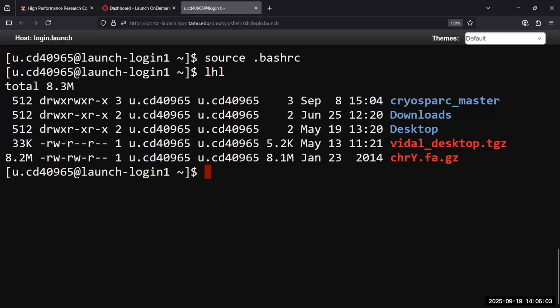Let's see your, you need to take space out right there. Oh, look, wait. Oh no, that's you put it in a different corner. No, you put it in the file. You need to put it in this file right here. Yeah, I'm telling you. Let's see.